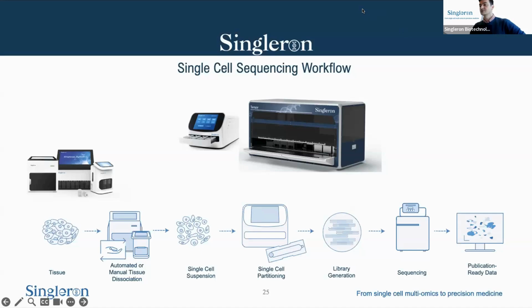How much sequencing is required for MobiuSCOPE? Yeah, because we would like to have as many unique fragments as possible from each individual transcript, so that we can do a more accurate, comprehensive and complete assembly to piece them together to get the full-length information.